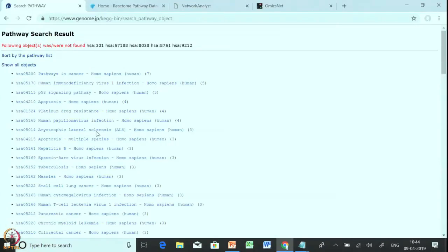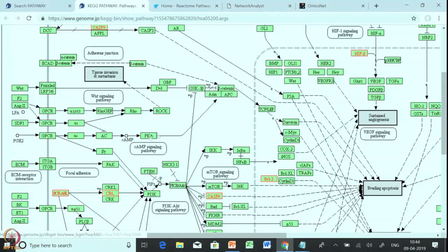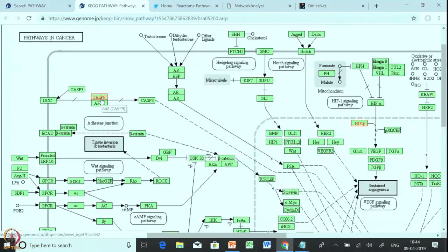After clicking the execution tab, you can see the KEGG Mapper has already generated a complete profile of what are the different kinds of pathways and how many hits are there in each pathway. If we click into each of these pathways, it will redirect you to the complete pathway, and you will find what are the proteins that are present, and they are highlighted with a yellow color and the red font. So this is the glimpse of how you will use KEGG Mapper and how you will convert your UniProt ID into a KEGG ID.